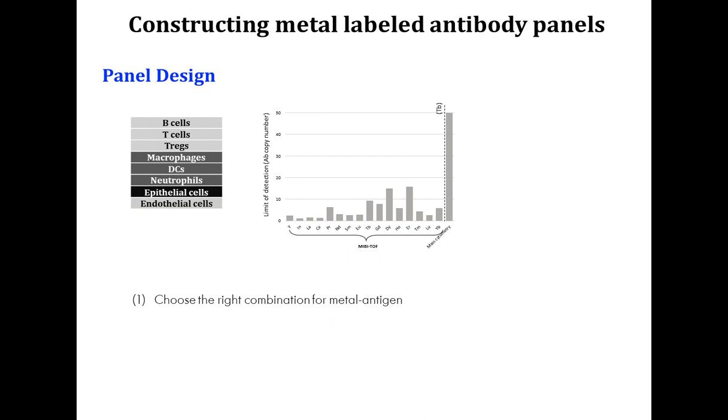And just to give you a brief explanation, in order to estimate the effective sensitivity for detecting metal-tagged antibody in tissue, our group stained serial sections of tonsil with 16 different elemental metal isotopes conjugated to an identical monoclonal CD45 antibody. From each section, the 100 micron field of view was imaged by MIBI.